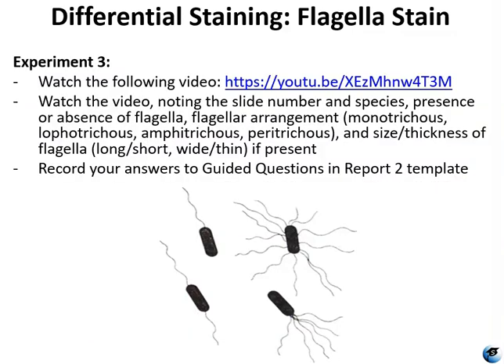Here is another quick demo of the flagellate stain technique. Incidentally, I tried to find a demo that would show you the stain as it was being performed, but all of the videos I found were demonstrating not only the staining technique, but also very, very poor safety practices. I mean, they're using bare hands and getting bacteria and dye all over them, and I don't want to use that as an example. So here is a good summary of the steps.